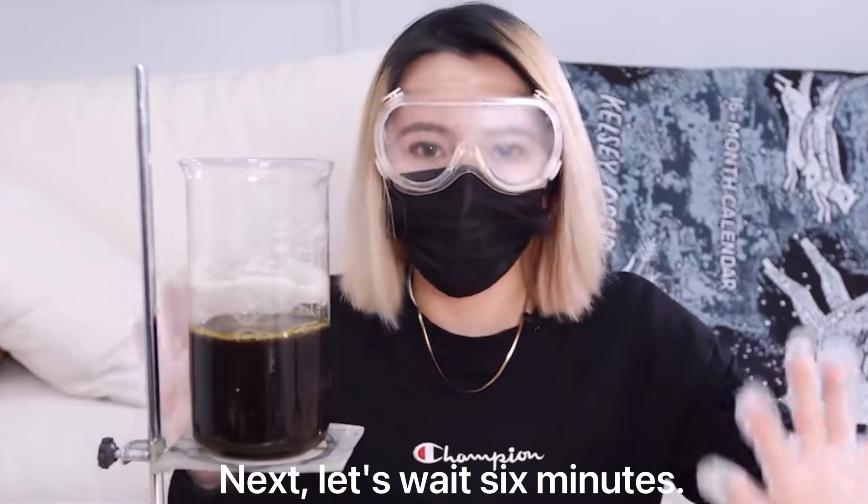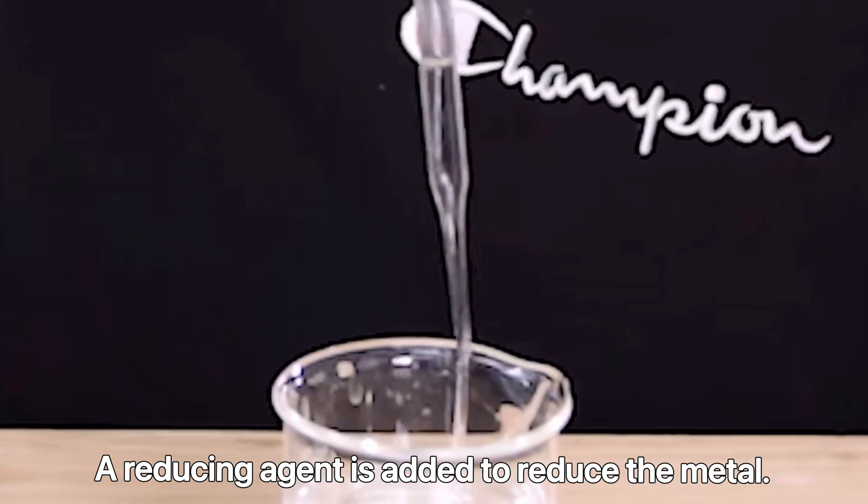Next, let's wait 6 minutes. A reducing agent is added to reduce the metal.